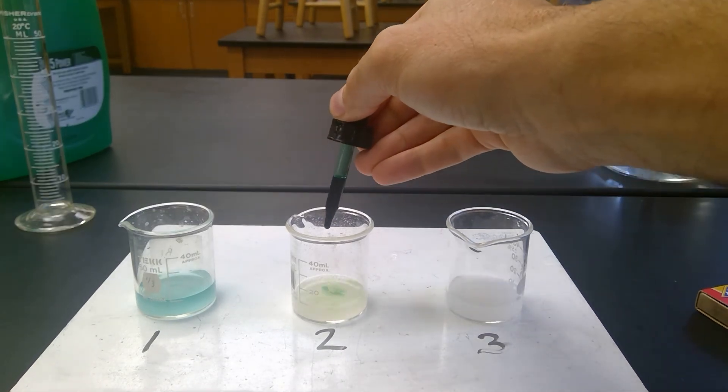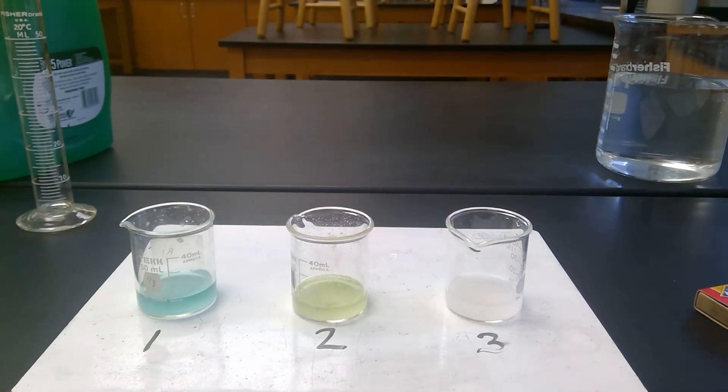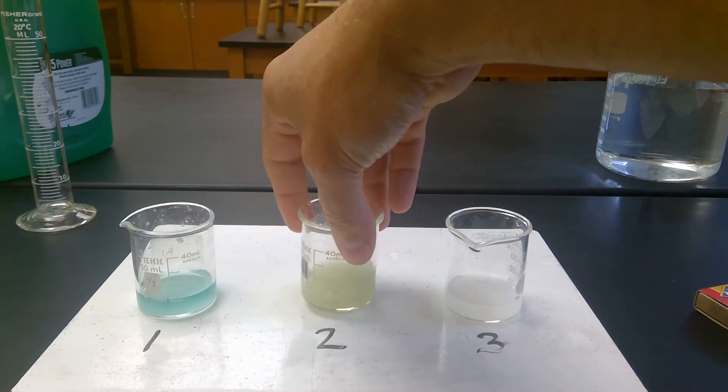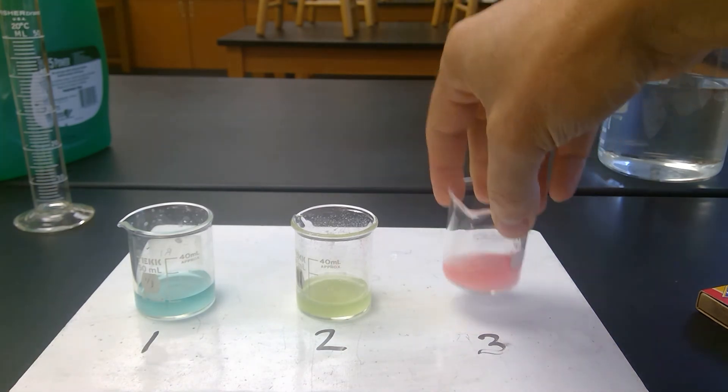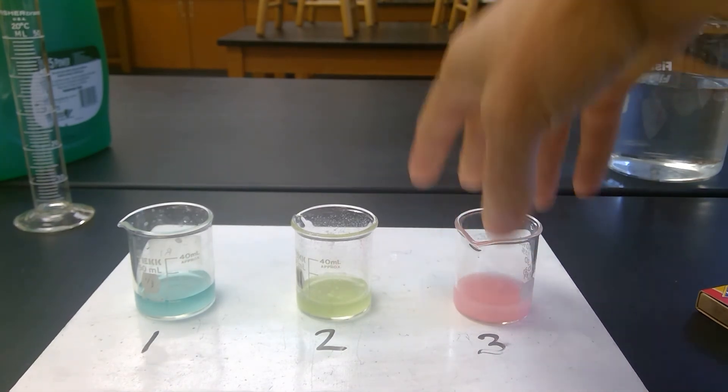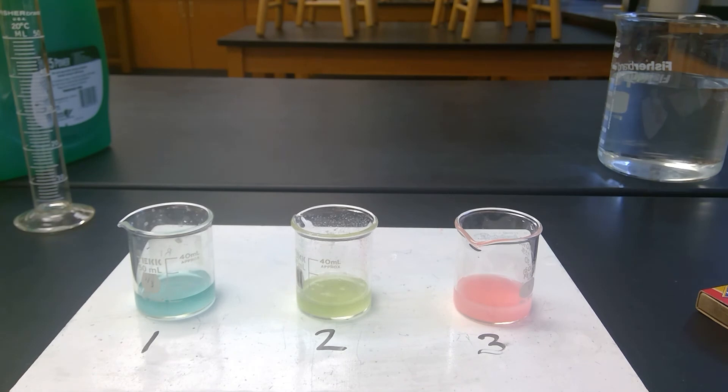Number two, you'll see it's kind of a yellow green color. And then number three, you see it's a pinkish color or a red color.